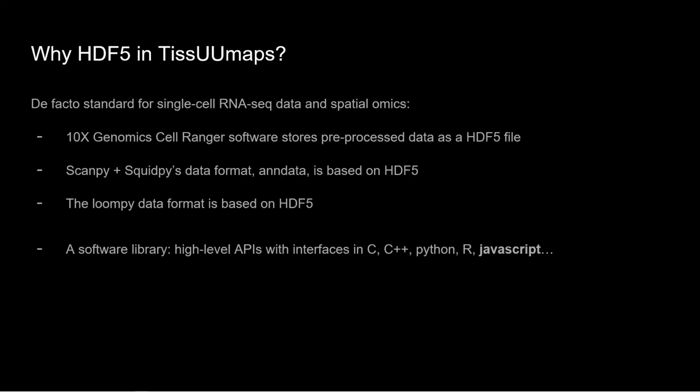Why did we want to add HDF5 in TissUUmaps? It's because it's the de facto standard for single-cell RNA-seq and spatial omics. It's used in the 10x Cell Ranger software, the software that produces the data from raw files, and it's how they store the pre-processed data.